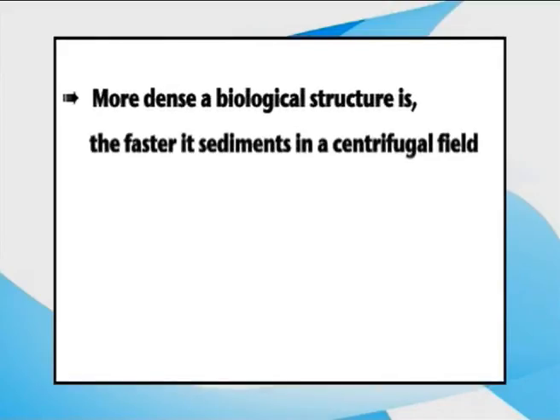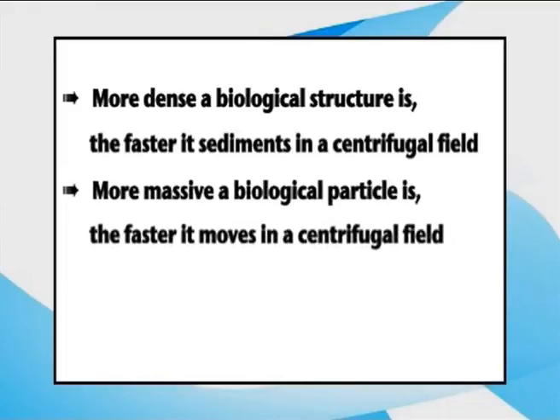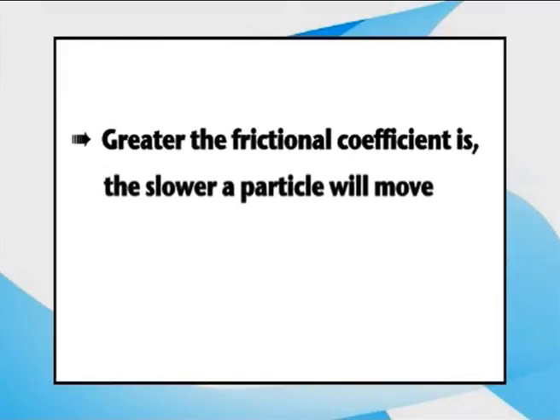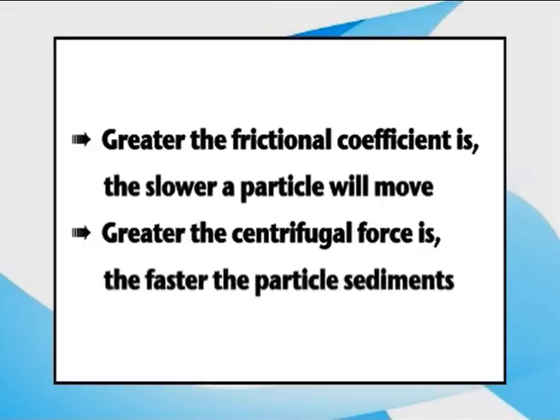That means the more dense a biological structure is, the faster it sediments in a centrifugal field. The more massive a biological particle is, the faster it moves in a centrifugal field. The denser the biological buffer system is, the slower the particle will move in a centrifugal field. The greater the frictional coefficient is, the slower a particle will move. The greater the centrifugal force is, the faster the particle sediments.